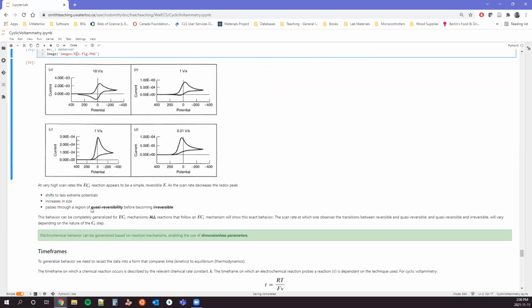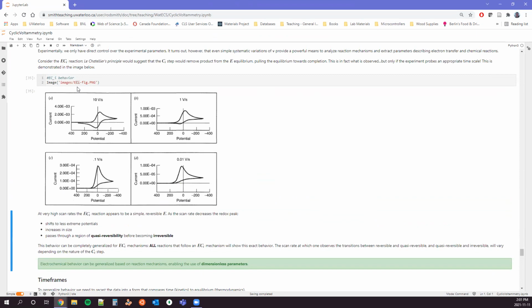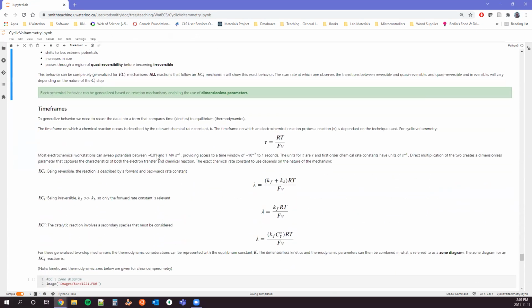And so that's where we start coming into these quasi-reversible and irreversible terminology. We have this characteristic behavior in our limiting situations. And in this quasi-reversible region in the middle, we've got kind of a blend of the two, right? It works out beautifully that all of this behavior can be generalized based on mechanism. And so as long as we can generalize based on this, that we know that we have an electron transfer followed by a chemical reaction, we can convert the whole system into dimensionless parameters, and we can use that to view any individual reaction that is following that mechanism.